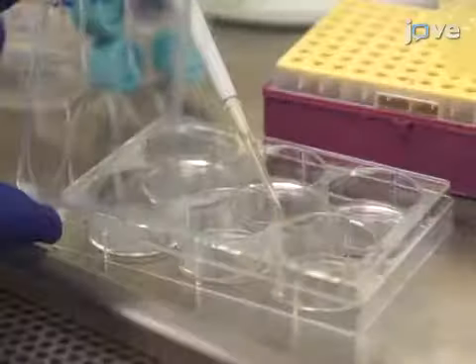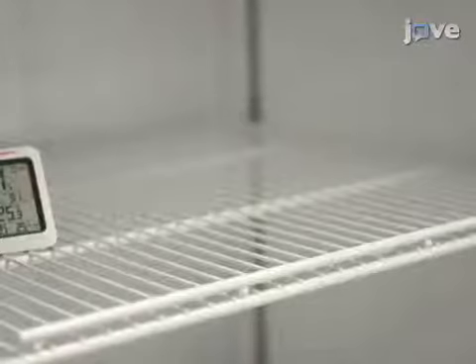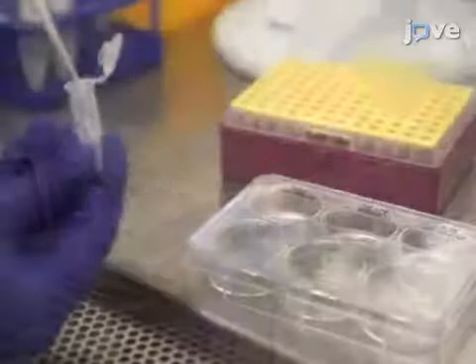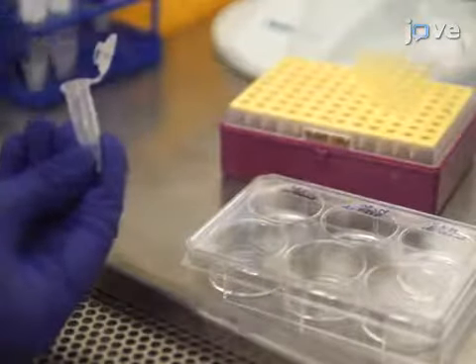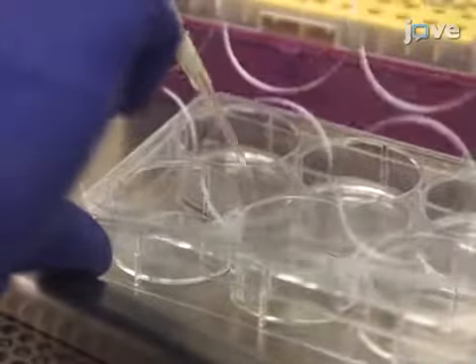Next, add 7.5 micrograms of double-stranded RNA to each well and incubate the cells at 25 degrees Celsius for 24 hours. Add 0.7 millimolar of copper sulfate to induce the expression of Notch and incubate the cells at 25 degrees Celsius for 3 days.